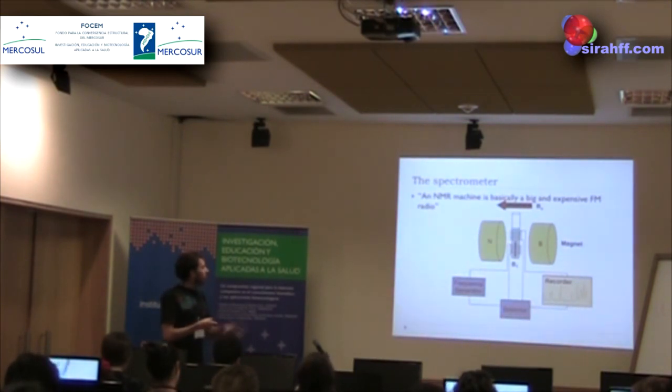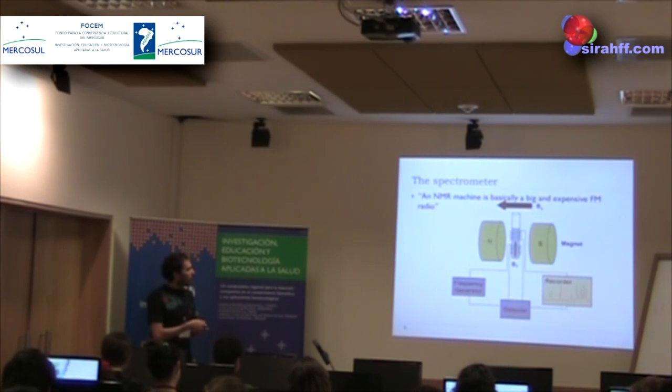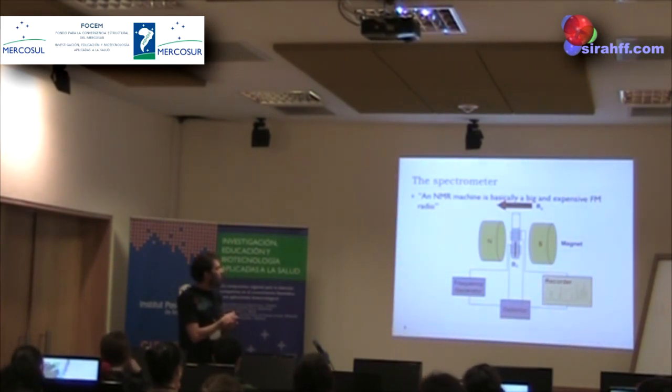Now, I will spend five or six slides telling you about the hardware. How do we measure an NMR spectrum? Well, this is a very nice definition I read in a textbook: an NMR machine is basically a big and expensive radio.